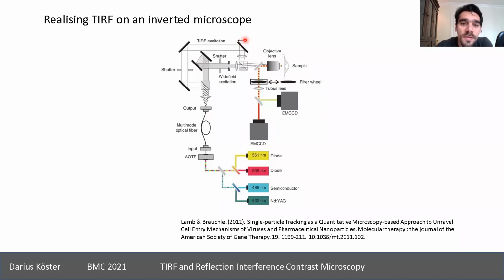So these little arrows, that's the important part in the TIRF, so you can move the mirror, and that changes at which angle or at which position the TIRF laser hits the objective. Because this is how you actually generate the high incidence angle, and in a future slide, you will see this in more detail. But this is one important part, that the laser coupling in is mobile, so that you can move where the laser hits the objective. Then you need, of course, a dichroic.